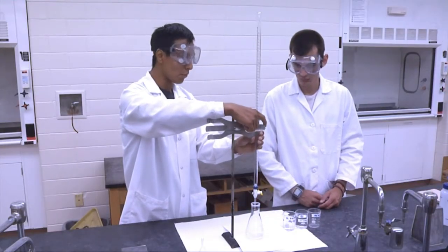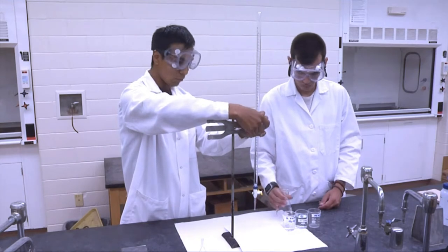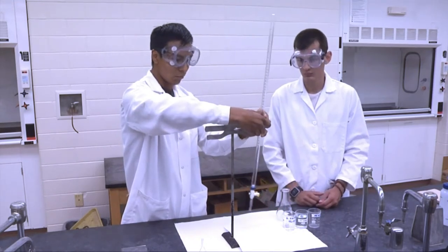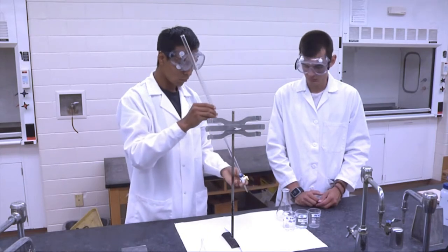In use, a burette is mounted to a ring stand with clamps. Before use, a burette should be rinsed well with deionized water, then rinsed once with the solution to be used with the burette.